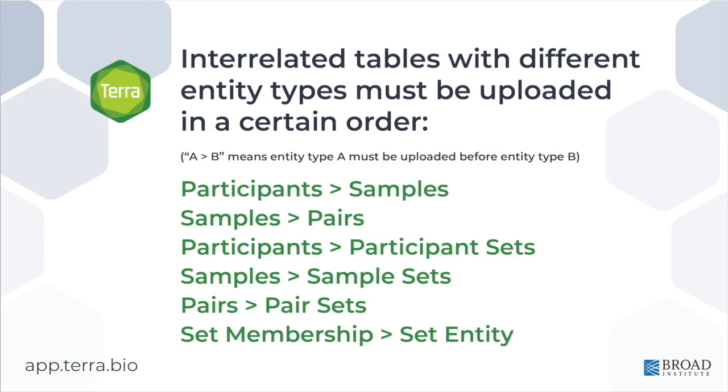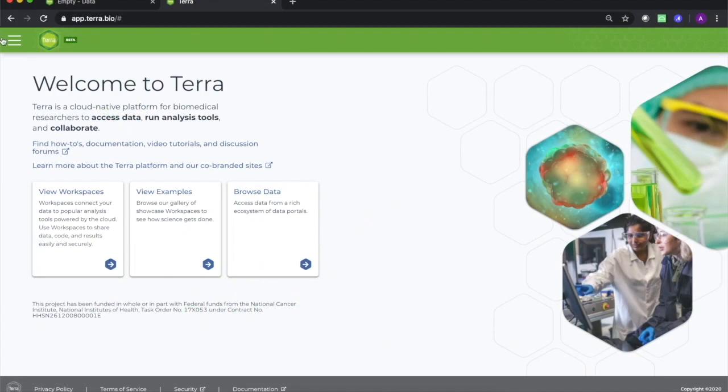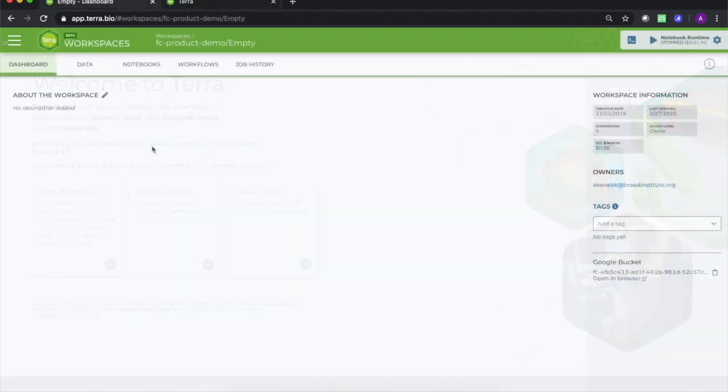If you do not do this in the correct order, you may see an error message when trying to upload. Okay, we are almost ready to create our own data table from scratch and upload it. Let's return to the Terra interface to see how the data is uploaded.